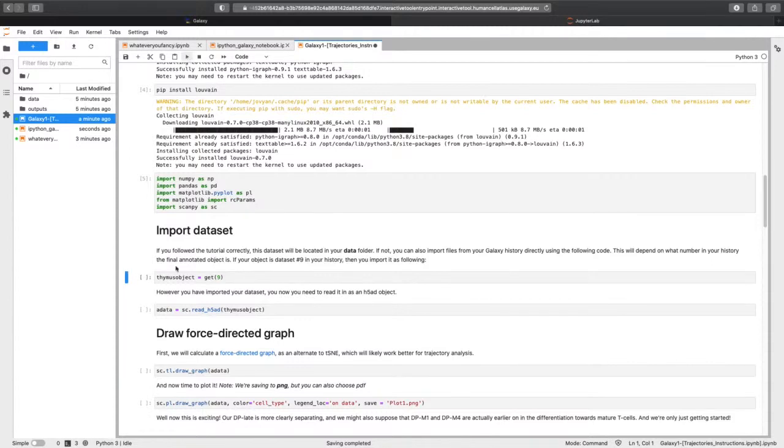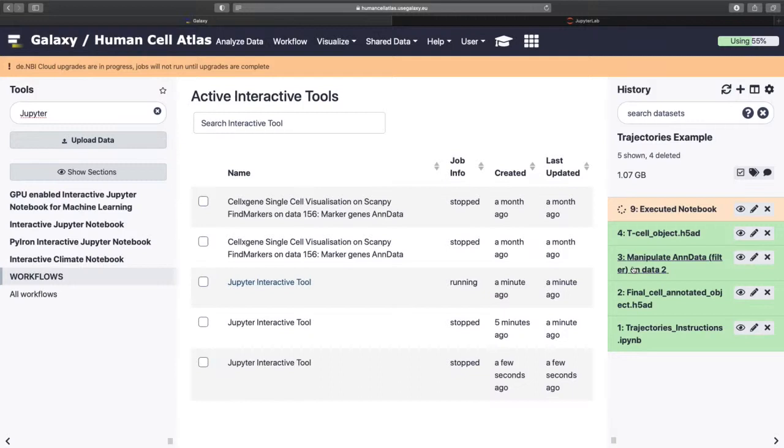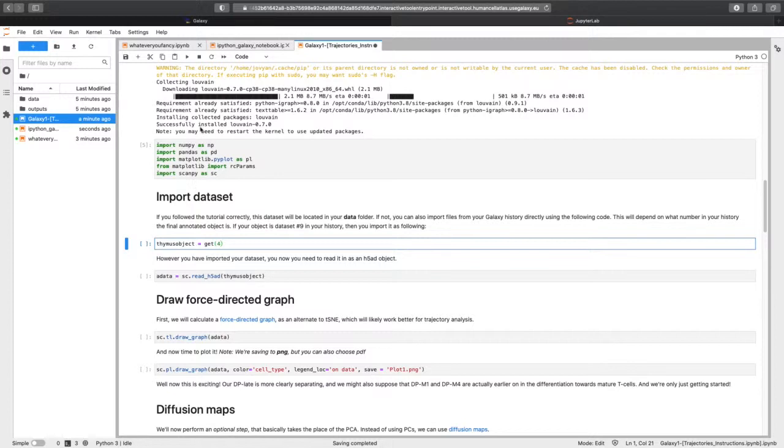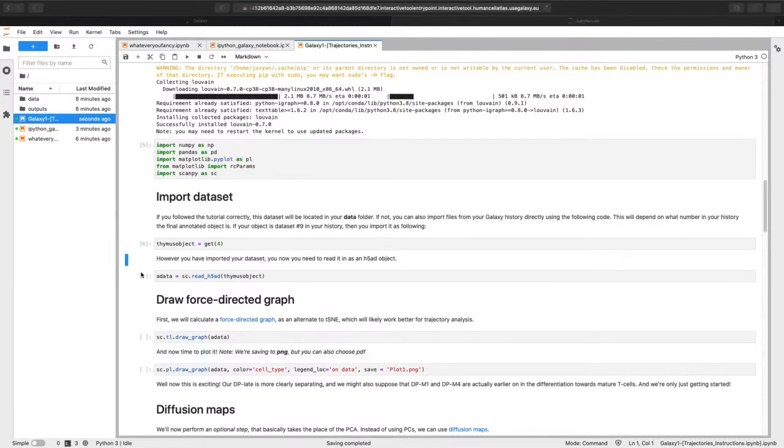And then here you're just importing those lovely tools into your environment so you can use them. All right, this is fun. So this is where we're getting our object. So if I come over here, our object's actually number four in this history. So I need to change this to be number four. And it's going to pull that data set from my Galaxy history. It's a big data set, so it's going to take a little while. And we're there. It did take a little while.